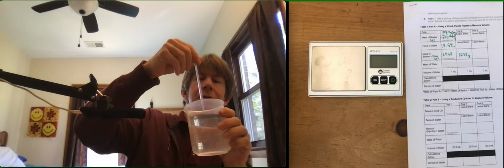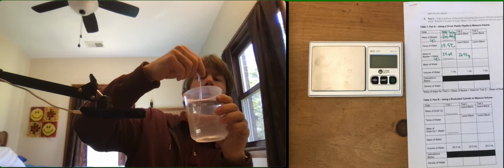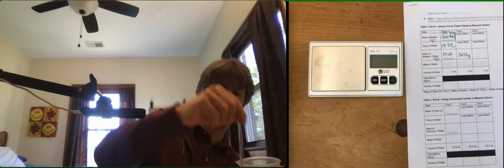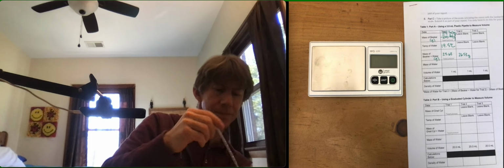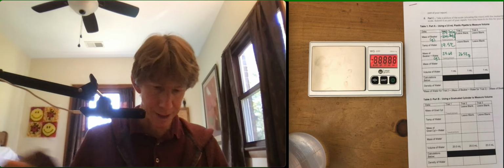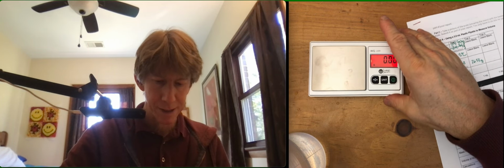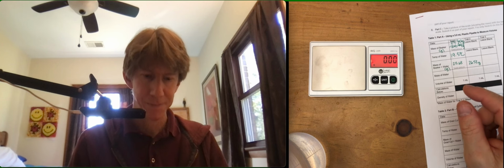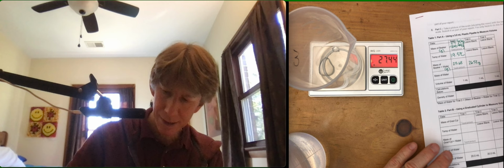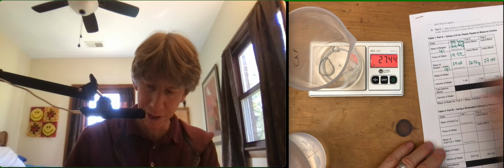Air bubble. Careful of air bubbles. Yeah, right there. Turn it on. Oop. I got a little water on my scale, so let's move that. Get my dot back. Put it on the scale. 27.44 grams. I don't need it.